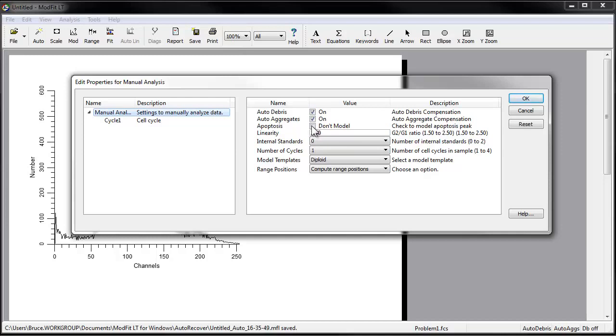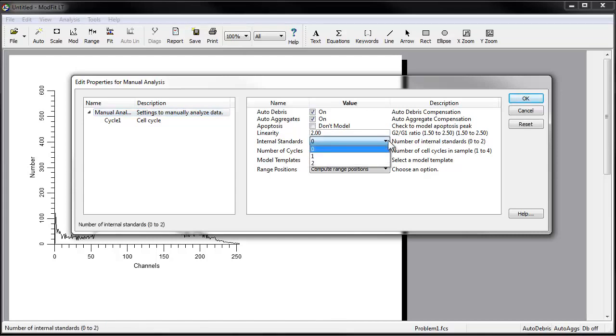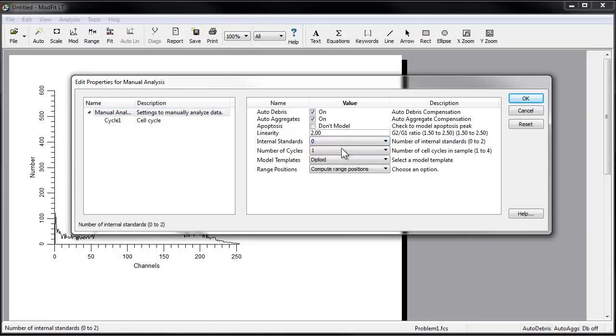This option is used very rarely and only with very specific protocols. Set the linearity to 2.0, which is the default G2-G1 ratio for ModFit LT. There are no internal standards in this file, so set internal standards to 0.